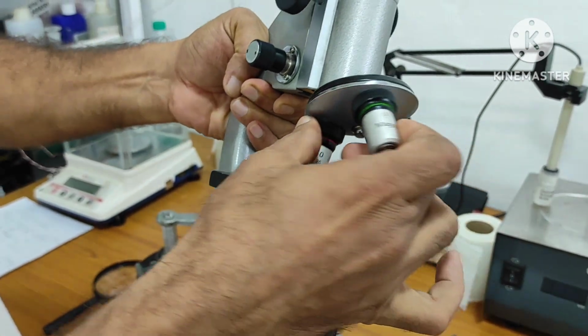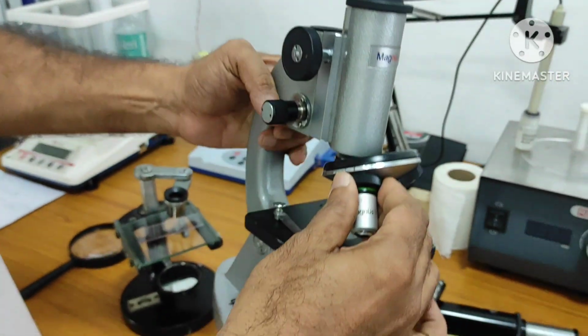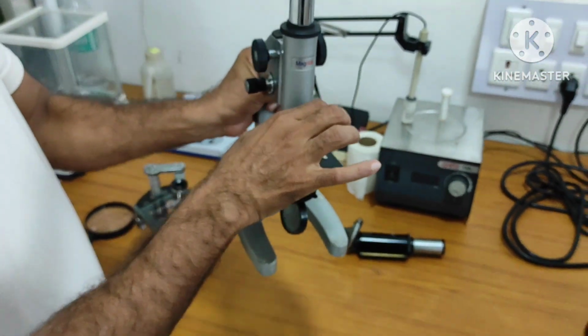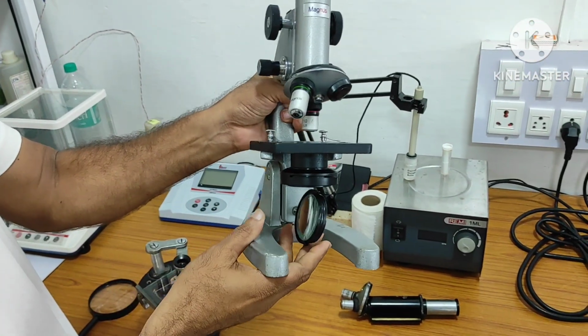Same way here, I think this is 20x, right? Even till 40x, right? 100x we can put on this nose. So it is called as nose piece for the objective lenses, right? So this is objective lens.